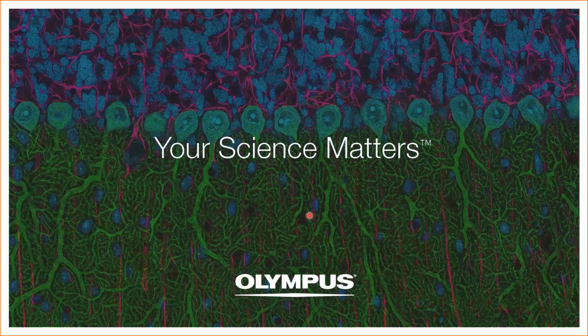Thanks, Tim. That's really important for our customers to think about, especially when they're looking into their sample holders. Gal, the next one is for you. When using corrosive or toxic clearing medias, what considerations should be taken with these samples when imaging? Yes, that's a great question. There are many different clearing methods out there, and some of them have very corrosive media.